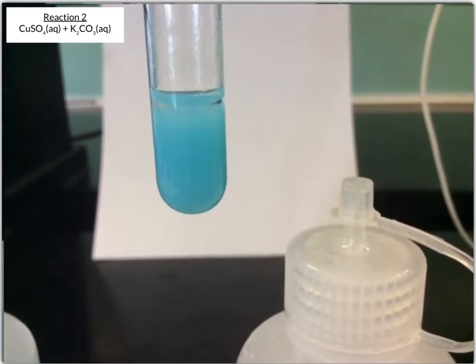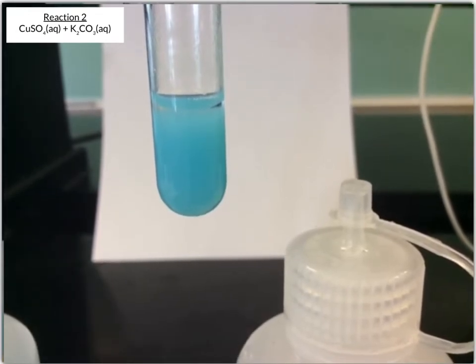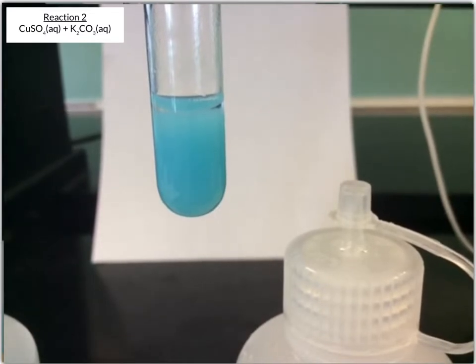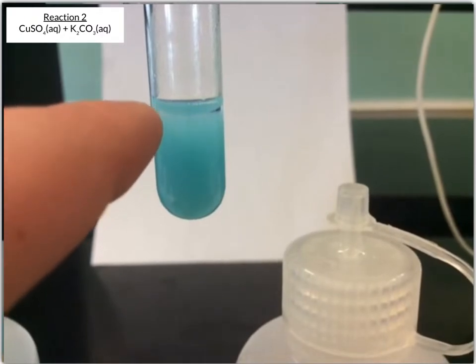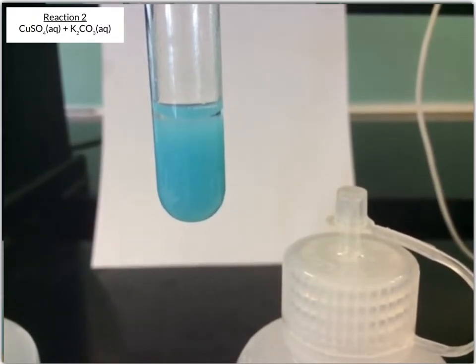Now after letting it sit for quite a while, you can start to see it separating. You can see a little bit of the solids still floating at the top, but you can see kind of that clear line at the top, and so that's where the solid's finally settling out of that solution.